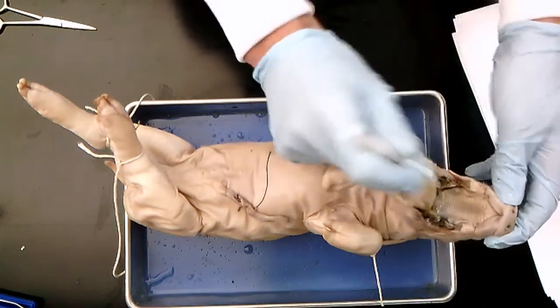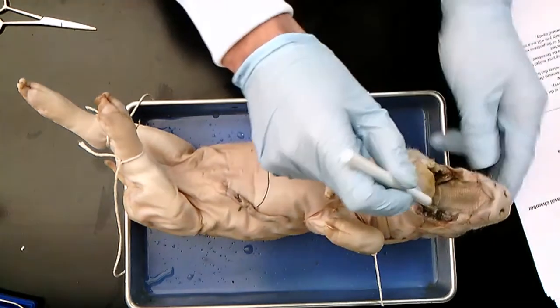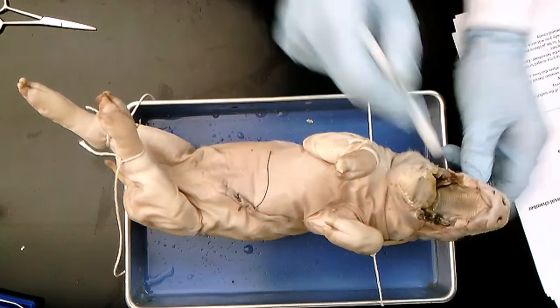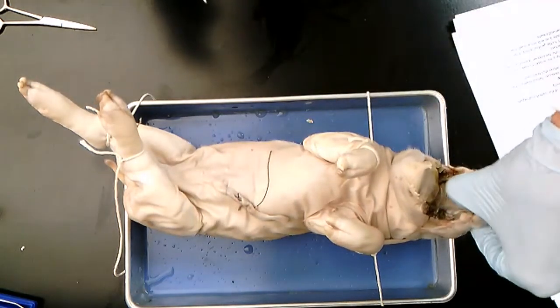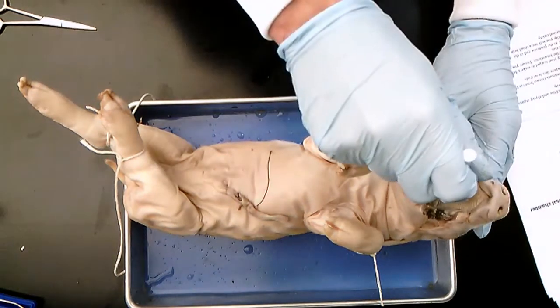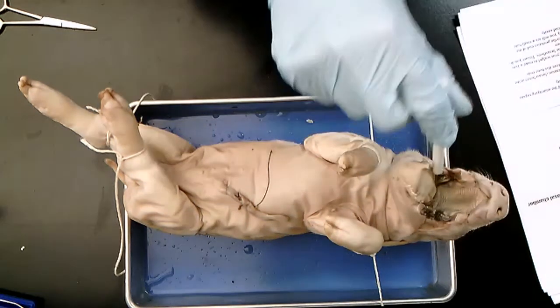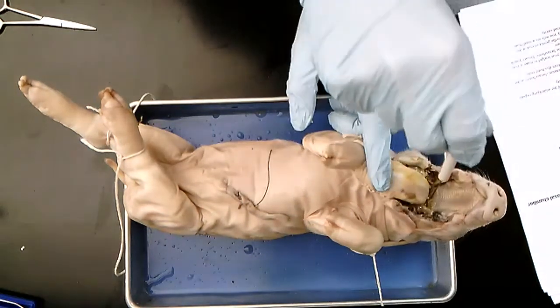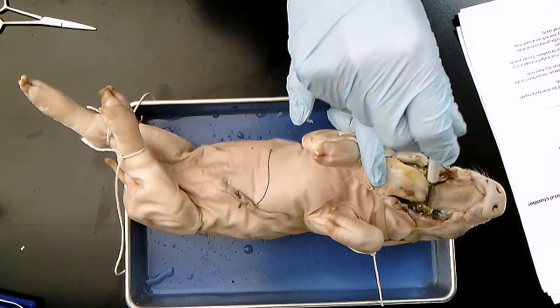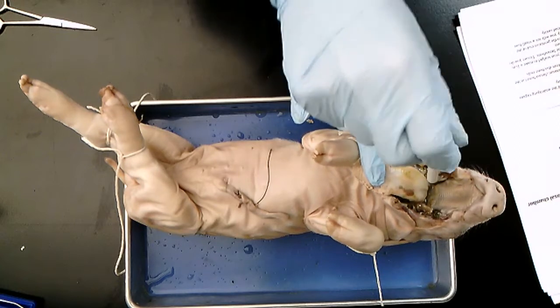They may have to identify the teeth, which should be fairly straightforward. Then they have the hard palate, which if they take their thumb and put it on the palate, it's extremely hard. Right below the hard palate is the soft palate. If they take their finger or any of the instruments and press down, it should be almost like Jell-O. It's very soft. So those should be fairly easy for the students to identify.